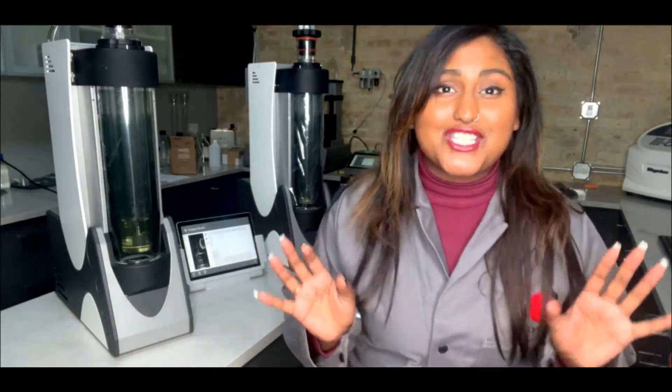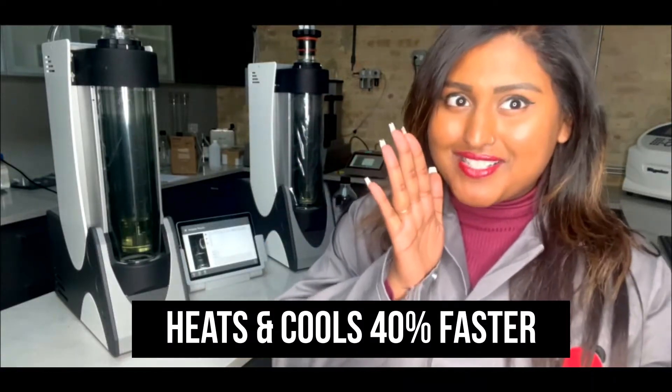Today we're going to be focusing on the sample throughput, just like our previous video. This time we'll have even more throughput because the Foam Diddy Gen 2 heats and cools nearly 40% faster.